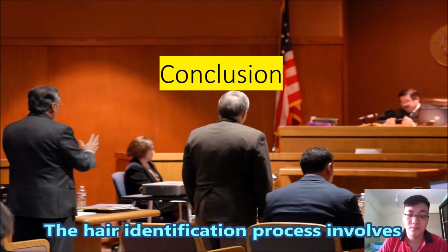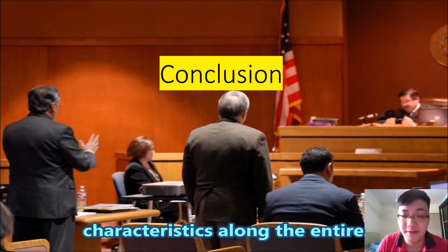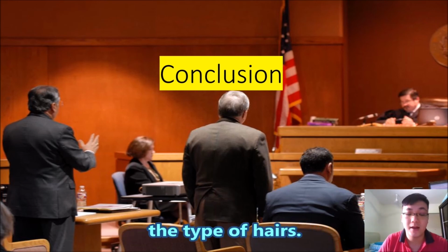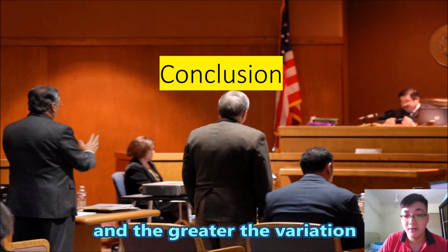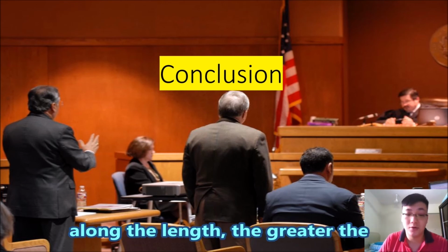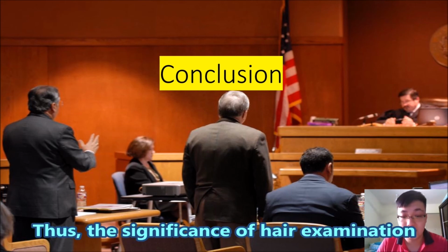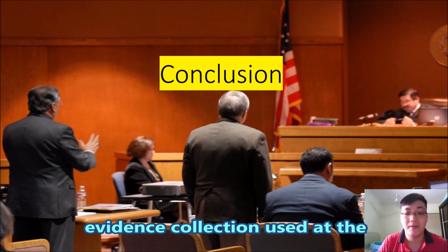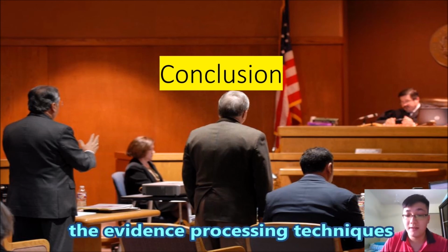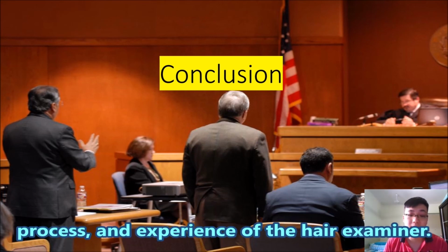The hair identification process involves the examination and comparison of hair characteristics along the entire length of the hairs as well as the type of hair. Generally, longer hair has more characteristics to compare, and the greater the variation along the length, the greater the degree of significance. Thus, the significance of a hair examination result is dependent on the method of evidence collection used at the crime scene, the evidence processing techniques employed, the methodology of the hair examination process, and the experience of the hair examiners.